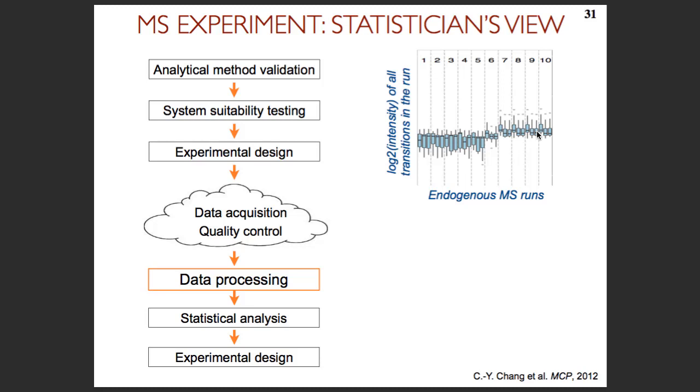And just looking at these box plots, the fact is that it's really hard to tell. And so we need to build into our experiment additional infrastructure to be able to distinguish artifacts from data acquisition or something else that could have happened here and the actual biology.